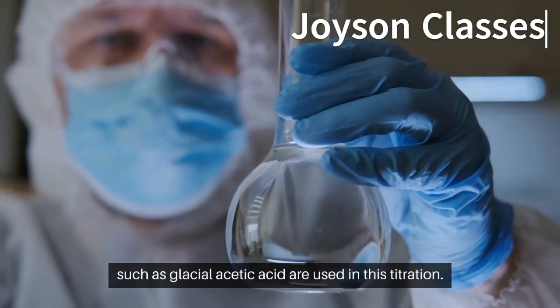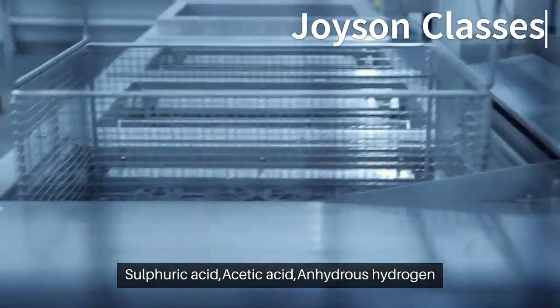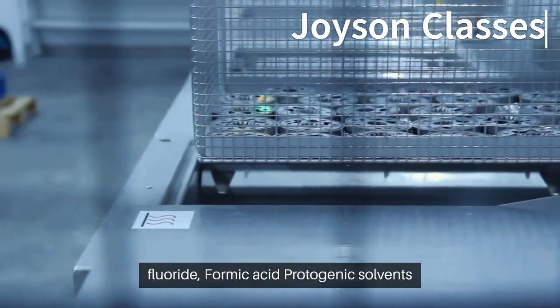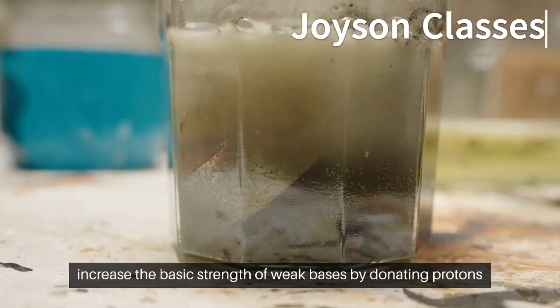Solvents. Protogenic solvents such as glacial acetic acid are used in this titration: sulfuric acid, acetic acid, anhydrous hydrogen fluoride, formic acid. Protogenic solvents increase the basic strength of weak bases by donating protons.